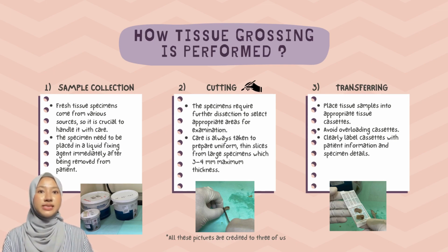Lastly, place tissue samples into the appropriate tissue cassette. Avoid overloading cassettes to allow reagents full access to each tissue sample. Clearly label the cassette with patient information and specimen details to maintain accurate tracking.